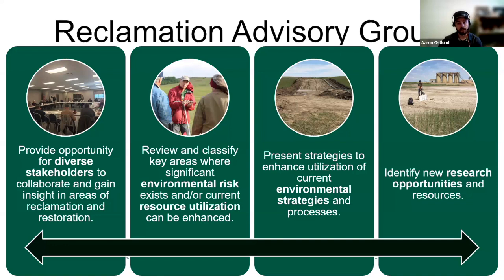So the PID workshop series is designed to bridge the knowledge gap between equipping field staff with technical understanding, and needing to maximize the potential of this photoionization detection and how that leverages our ability to do effective environmental assessment and remediation. So this is just part of a series, and we hope to continue to build on this and ultimately equip our stakeholders with more skills and knowledge around how we can effectively integrate this technology into remediation and reclamation.